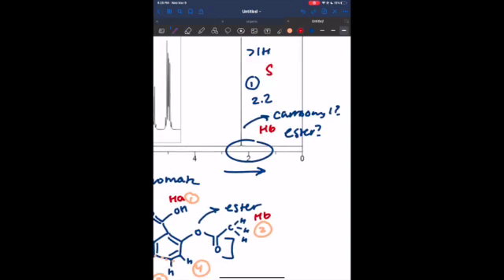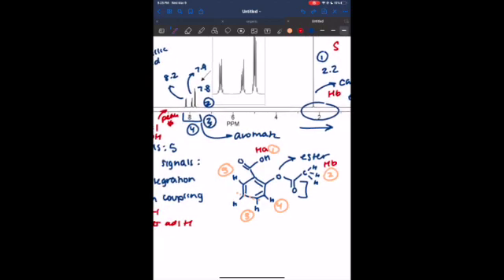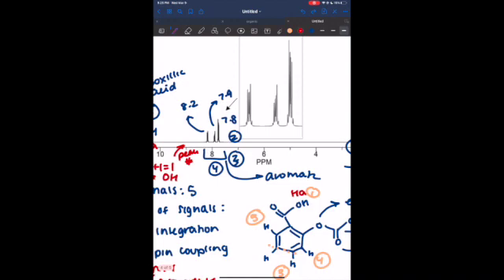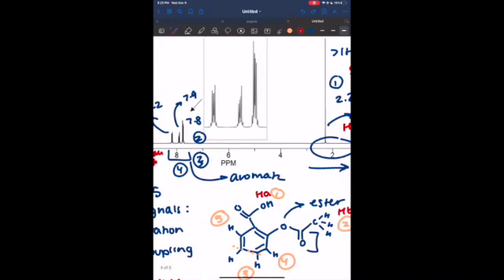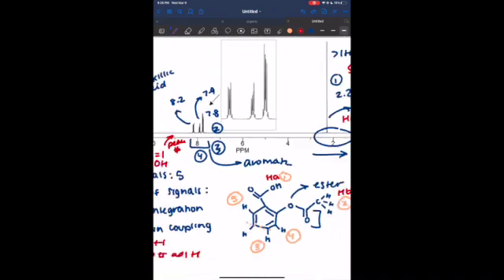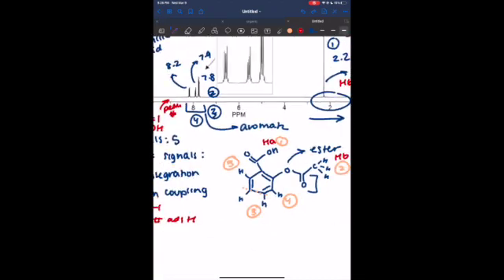And we're going to see here it is a singlet, so same thing, it's not going to have any adjacent hydrogens, and you can see that there are no adjacent hydrogens, which works out really well. Skipping through this, this is going to be looking at the aromatic. There are a bunch of multiplets, doublets of triplets of multiplets and all that stuff. So it's quite hard to see what exactly it is, but if you look here, we have 3 different signals within the aromatic ring, and that actually corresponds pretty well with what we have here.